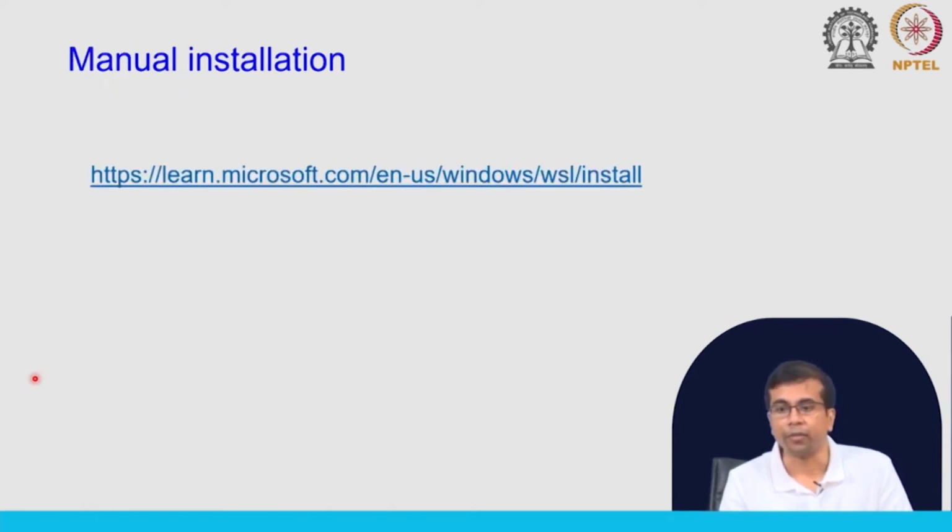One of the things I wanted to discuss is that you may want to access remote servers, whether you are in Windows or Linux, because some of the tasks of NGS analysis will require access to a computational server which has more memory, more storage, etc. Some of the tools that we will use later on require a lot of memory, and you cannot run them just on your desktop or laptop. So in those cases you want to access remote servers, or if you are doing NGS data analysis very regularly, you want to set up a pipeline with all the software and tools installed and set up properly on the server.